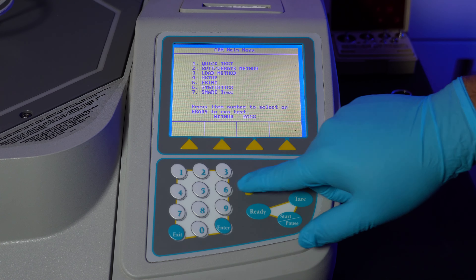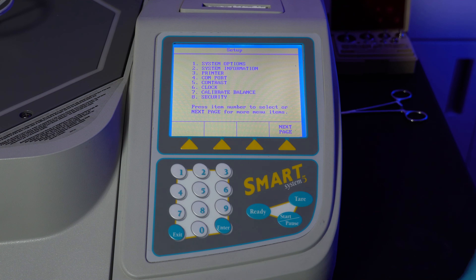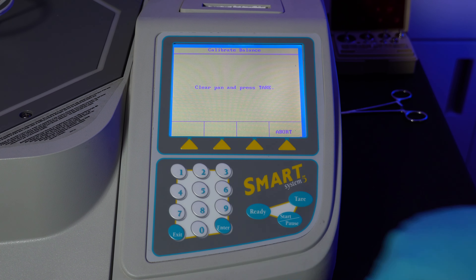Now on to the balance calibration. You will need a 10 gram weight. While on the main menu, press 4 to enter the setup menu. Press 7 to enter the calibration screen.